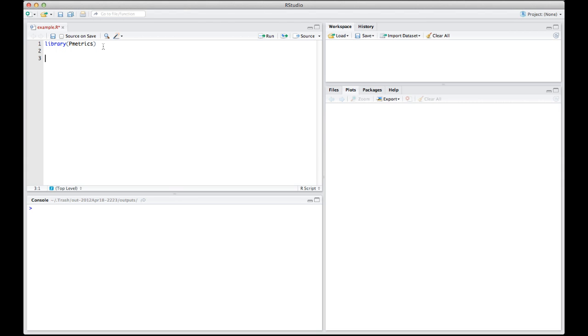The next thing that I usually do is make a comment that describes the run and numbers it. So this particular run had a TLag, a KA, KEL, and a volume.